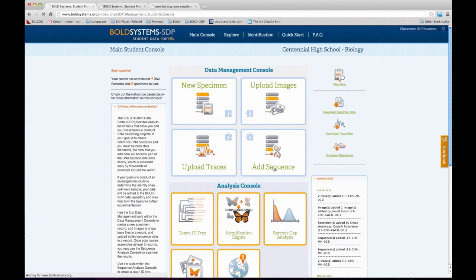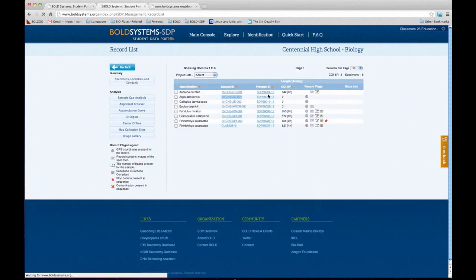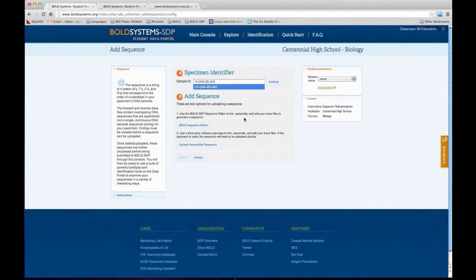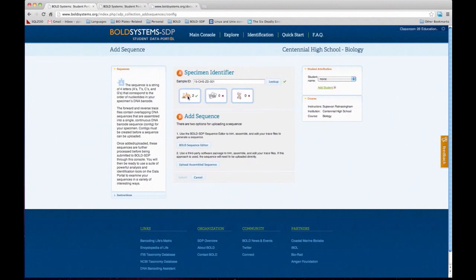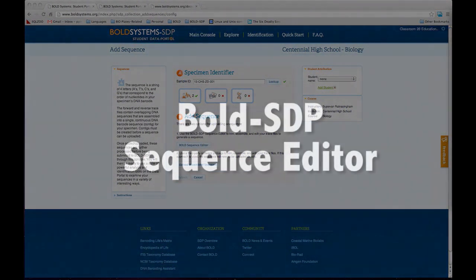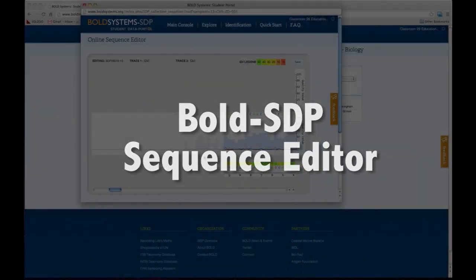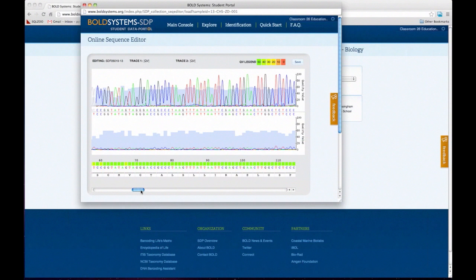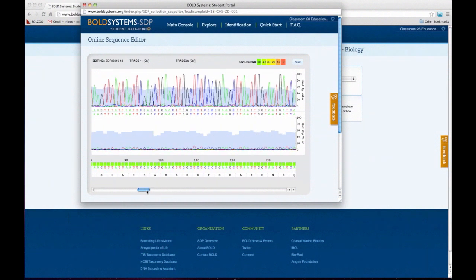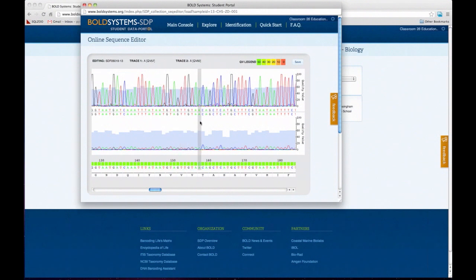Then lastly we're going to add a sequence. I'm going to go back to that same sample I just added the traces for. As you can see, now the system tells me there are two traces because I just uploaded those. What BOLD SDP is providing is an automated sequence editor. Once you have your traces uploaded, you can click on that button that says Bold Sequence Editor. It's basically a simplified version of programs like Sequencher or CodonCode — any trace-assembling and trace-editing program. This allows students to have a look at the trace and see what it looks like, but also edit and manipulate it as necessary.